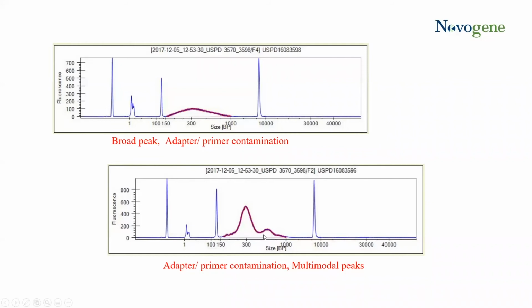Here, we are seeing two peaks. What this implies is that a vast majority of your sample has an insert of around 300, but you also have potentially a secondary insert. Maybe it's off target, maybe it's on target, we don't know. But we do know that if you sequence as is, the likelihood that you'll get the same data representation here as you will here is drastically changed. So it's important to know that most of the time we don't want to do this. And if we can separate the libraries by size, that's the best approach to go.